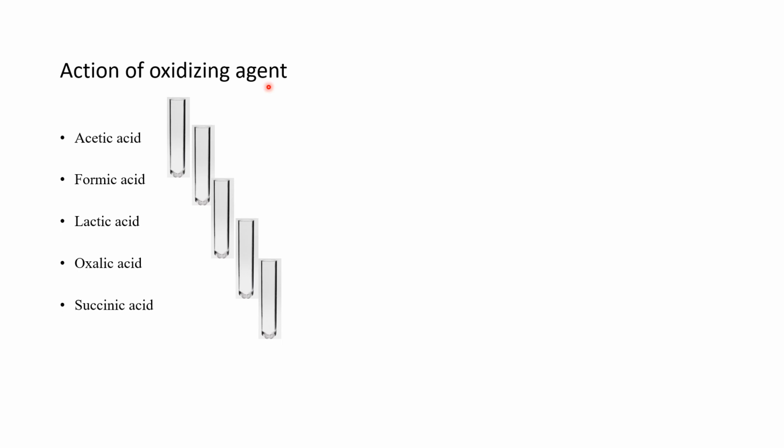This is heated in a water bath. Since your reactant here is potassium permanganate, which is a colored solution, you will know if the reaction is taking place if the color of the potassium permanganate disappears.